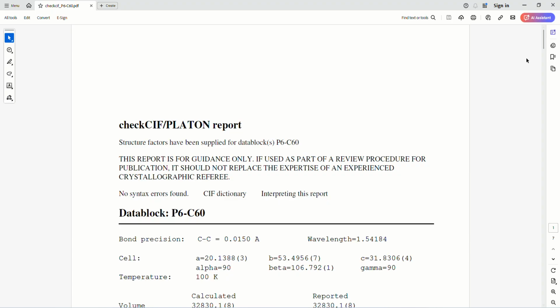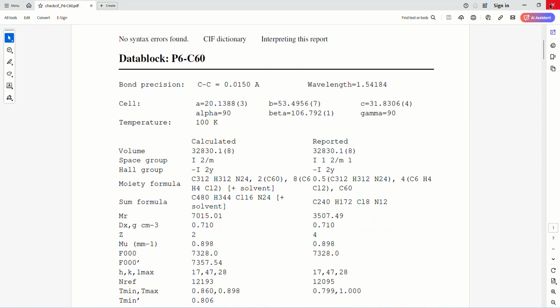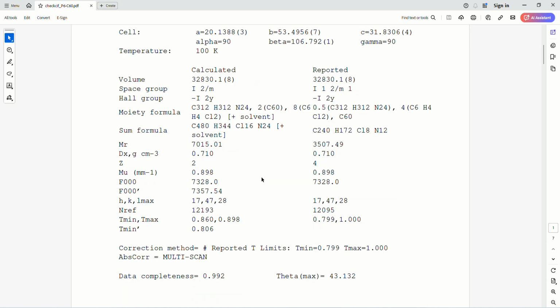So just to remind everyone, firstly, the structure has to be fit for purpose, and secondly, it has to be chemically sensible. If your structure has a super non-planar benzene or, I don't know, some terribly wrong bond lengths, or ADPs just look weird for no reason.